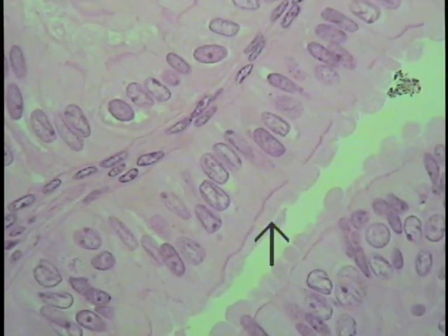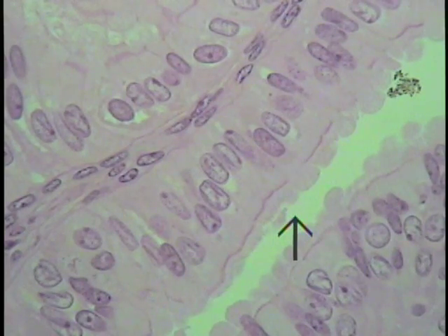When this type of situation is encountered, where you have cilia, you put that as a prefix on the name or the classification scheme of the epithelium being considered. So in this case, it would be a ciliated, simple columnar epithelium.